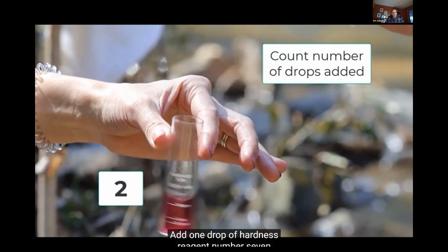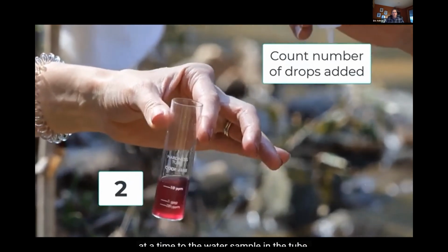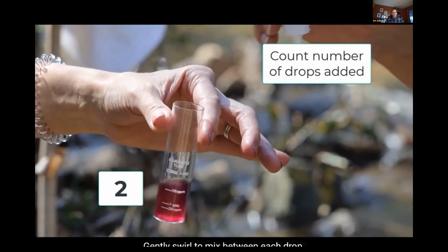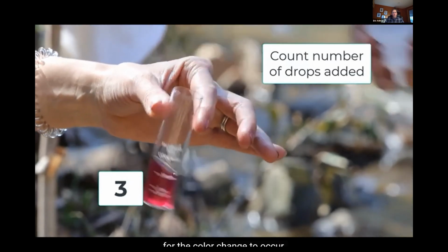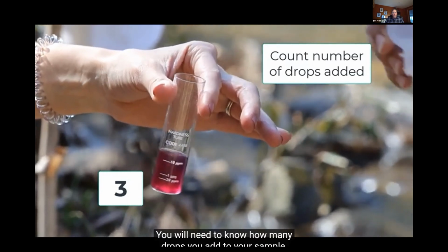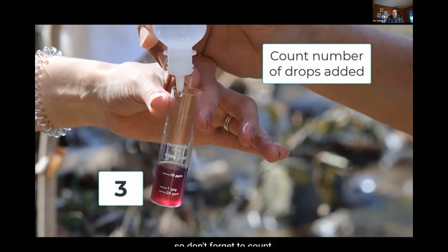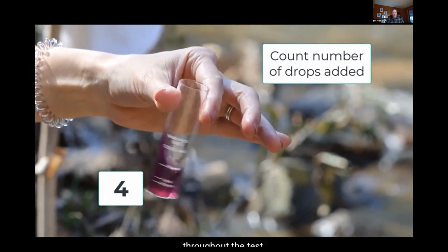Add 1 drop of hardness reagent number 7 at a time to the water sample in the tube. Gently swirl to mix between each drop. Be sure to allow time between drops for the color change to occur, especially during cold weather. You will need to know how many drops you add to your sample, so don't forget to count. You can keep the bottle in the vertical position throughout the test.